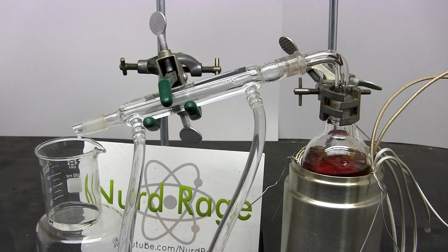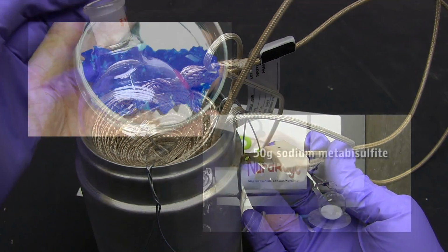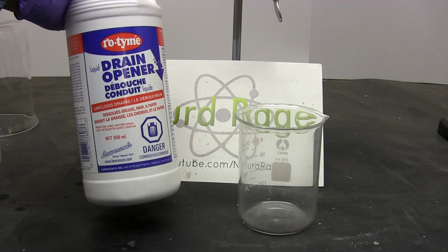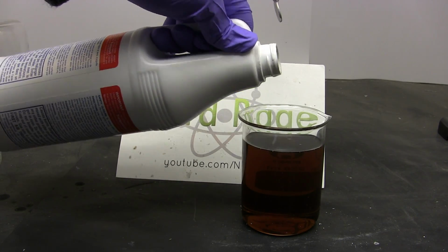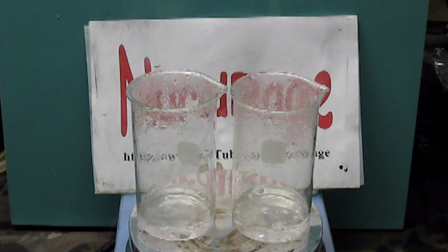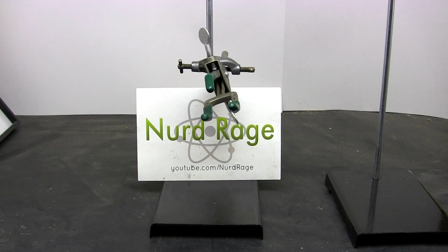Greetings, fellow nerds. In this video, we're going to purify sulfuric acid by distillation using the heating mantle we built in a previous video. Now, sulfuric acid can be made in various ways or obtained from some types of drain cleaners, but oftentimes it's not very pure and contains contaminants, particularly water. Now, you can boil it down to remove some of the water, but the most effective way to purify it is to distill it. So let's set up our apparatus.